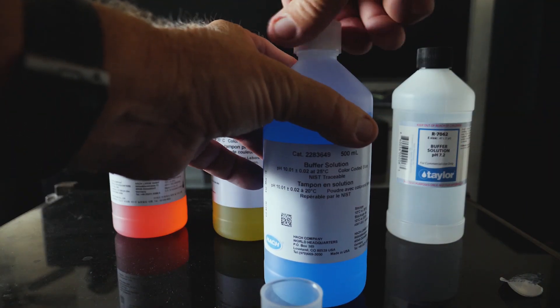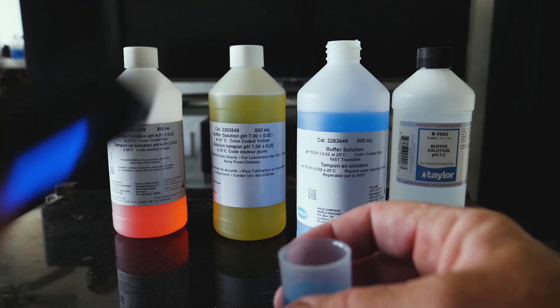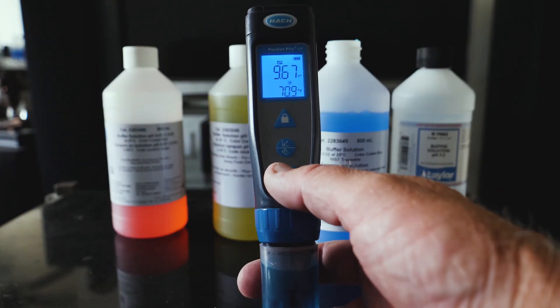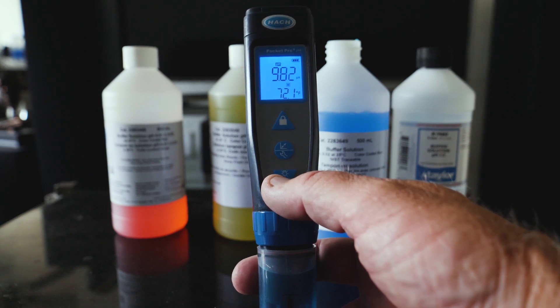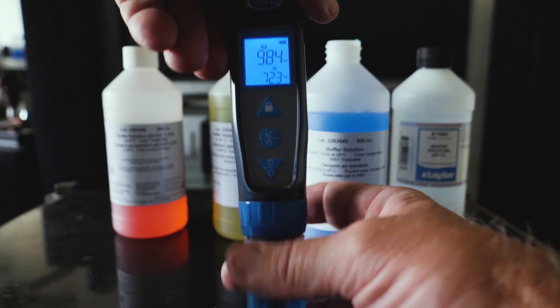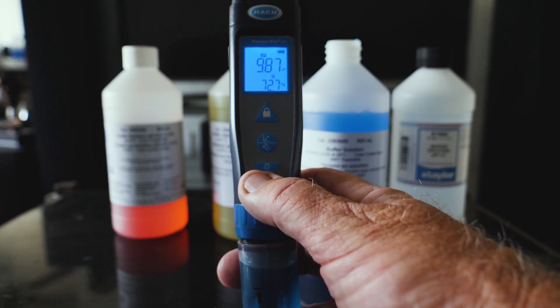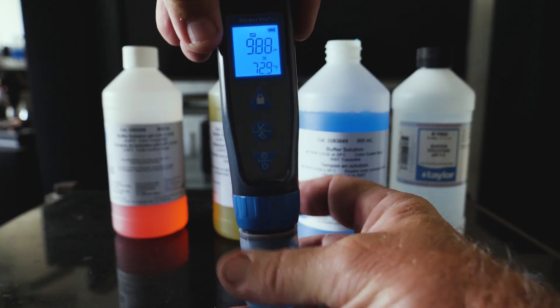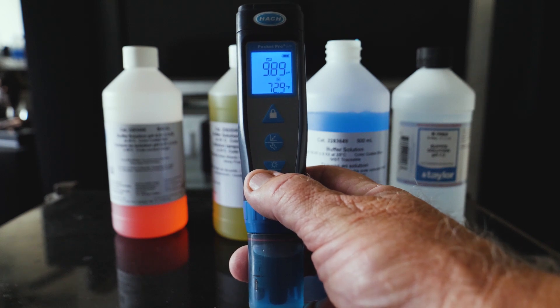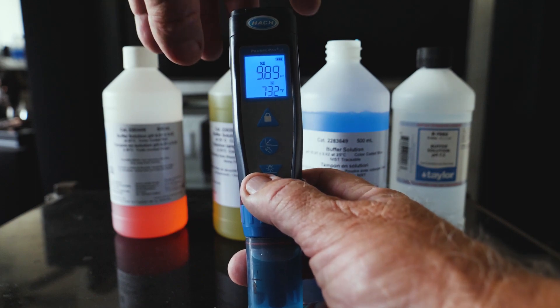Now let's go to the 10.0 solution and see what we got. We got 9.9. That's really good.